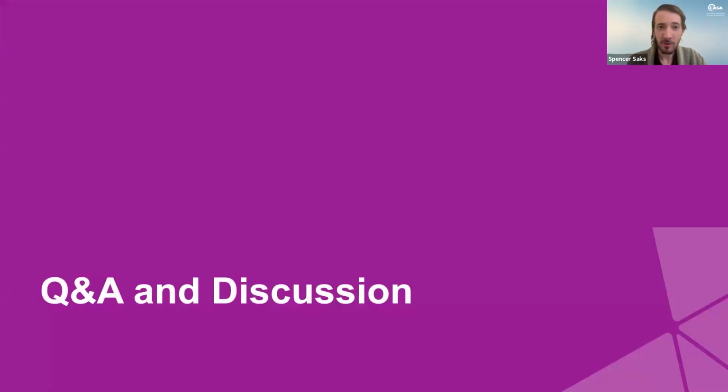Perfect. So thank you so much to the team for providing that presentation. That was really, really helpful. I do have a few questions that we can kick off with. And I saw that, Chunya, you provided a written response, but I think it might be good to ask the question verbally. So the question is, is freezing the samples before sending them out acceptable for the type of testing being done? And I don't know if Chunya, you want to answer that.